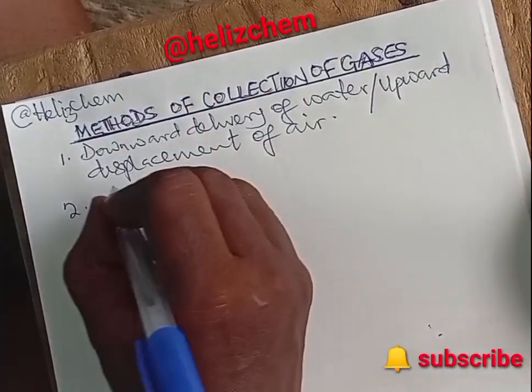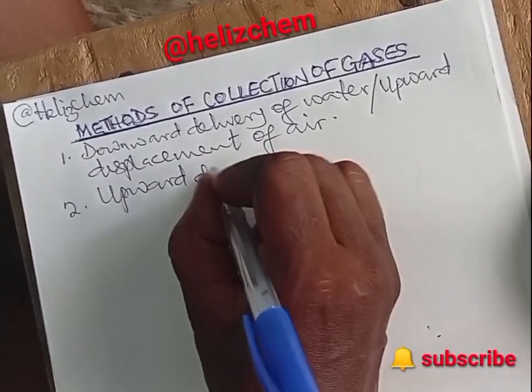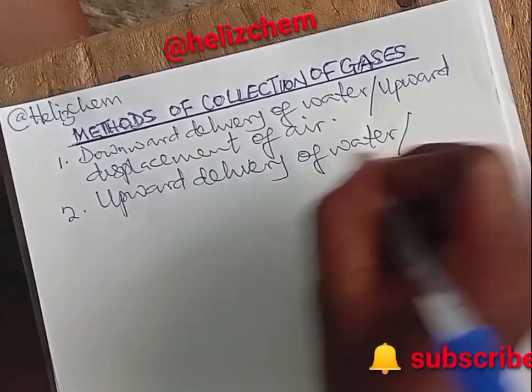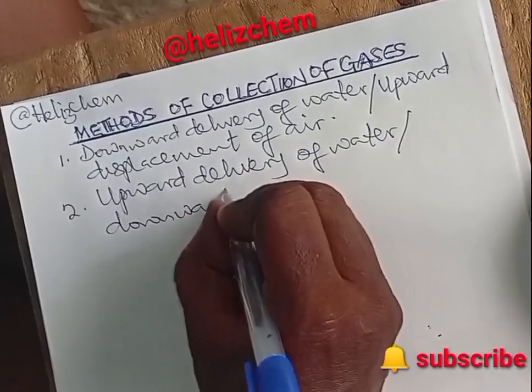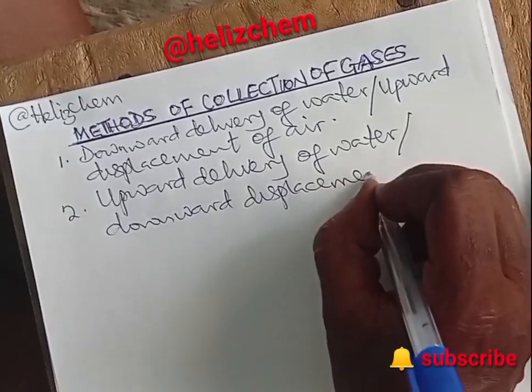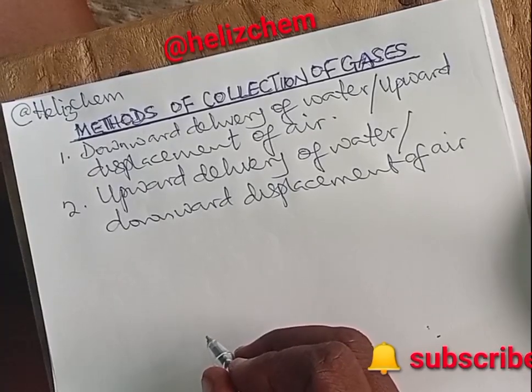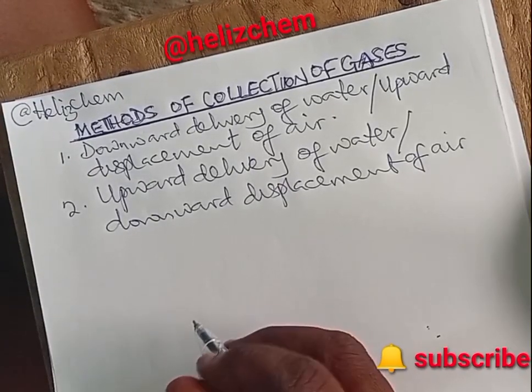The other method is upward delivery of water, or downward displacement of air. So these are the two methods of gas collection.